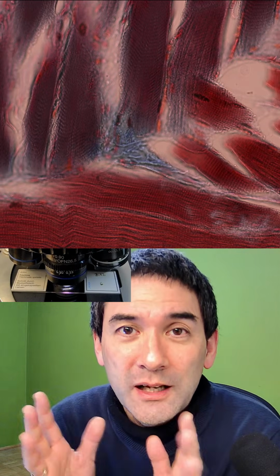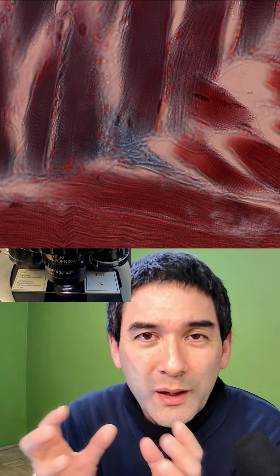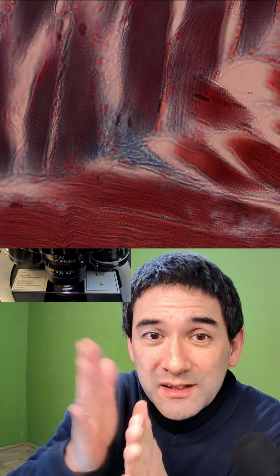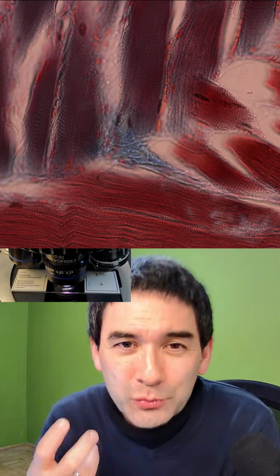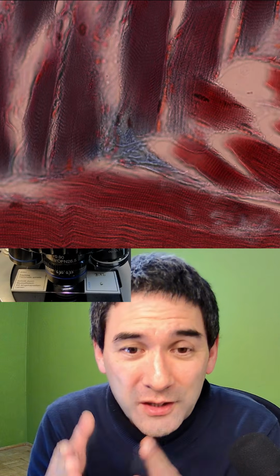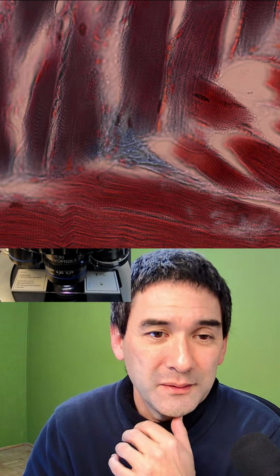So people realized already at that time, wow, on a molecular level, on a microscopic level, the structures are quite similar, and they were surprised that in a huge whale, the distance of those stripes is the same as in a tiny insect. I think in biology it's a remarkable realization about the so-called commonality of life. The deeper down we go into the cells, the more similar the living things start to become. Okay. So for this reason I like this slide here.